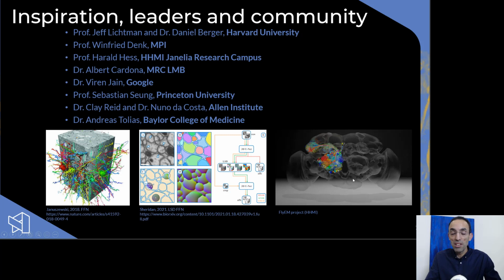And one outstanding example of a collaborative effort and a team effort at the Janelia Research Campus is the FlyEM project. Perhaps the most important project currently out there, in terms of the results are already out and you can already look at those results. It's truly impressive. There are, of course, several other amazing projects being undertaken right now and some outstanding results from other groups, but this is one of my favorites.